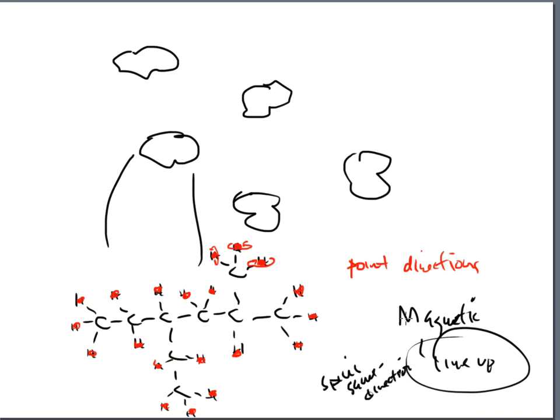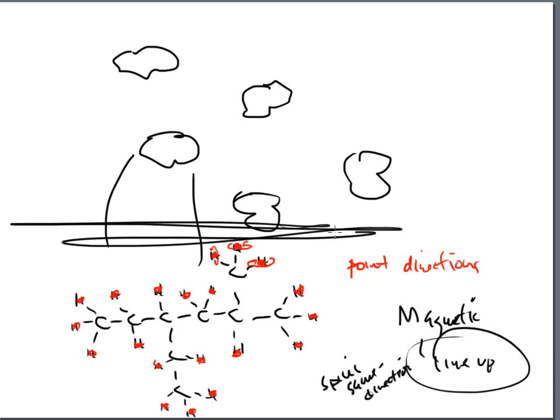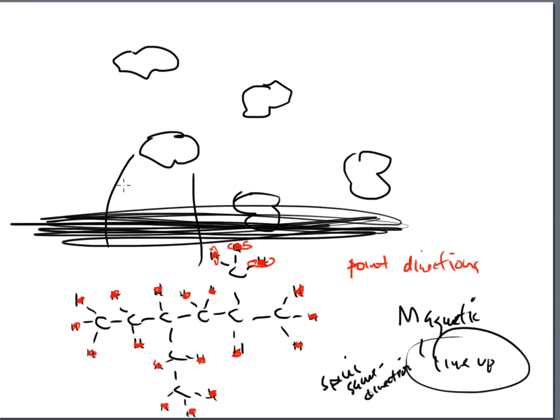They're very comfortable in that position, right? They're perfectly okay. They don't really have to do anything. They can continue to spin. We're not taking that from them. And as long as they continue to spin, they get to do whatever they want to do without any gripes, moans, or complaints. So a magnetic field is placed onto the molecule, and that magnetic field, attention, makes all of them line up in the same direction, and they're still spinning, but it takes a variable away.